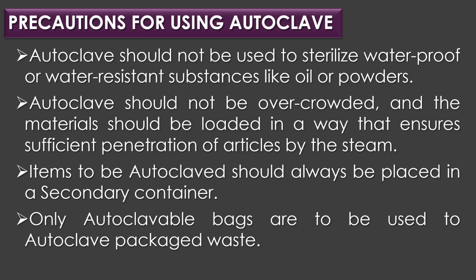Precautions for using autoclave. Autoclaves should not be used to sterilize waterproof or water resistant substances like oil or powders. The autoclave should not be overcrowded and the materials should be loaded in a way that ensures sufficient penetration of articles by the steam. The items to be autoclaved should always be placed in a secondary container. Only autoclavable bags are to be used to autoclave packaged waste.